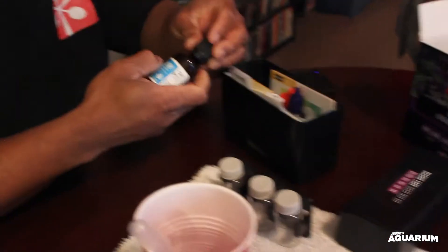And then it says remove the cap. After we do that, we have to use the chart to compare exactly where it's at. It remains stable for five minutes. We're going to look down into the vial to see exactly where our pH is at, and from what I can tell — it's pretty dark — it looks like it might be 8.2. Yeah, I'm getting 8.2.